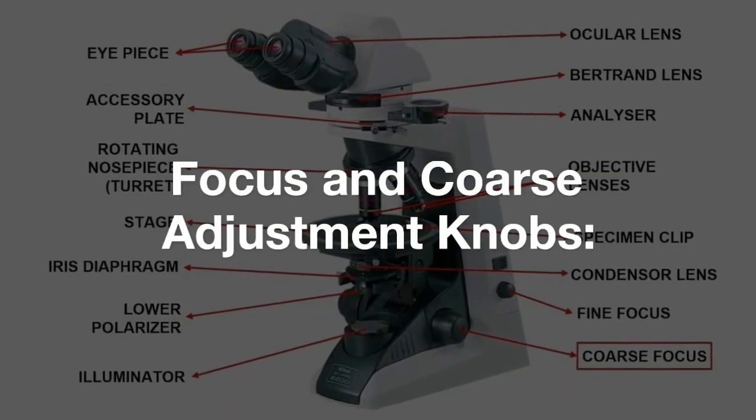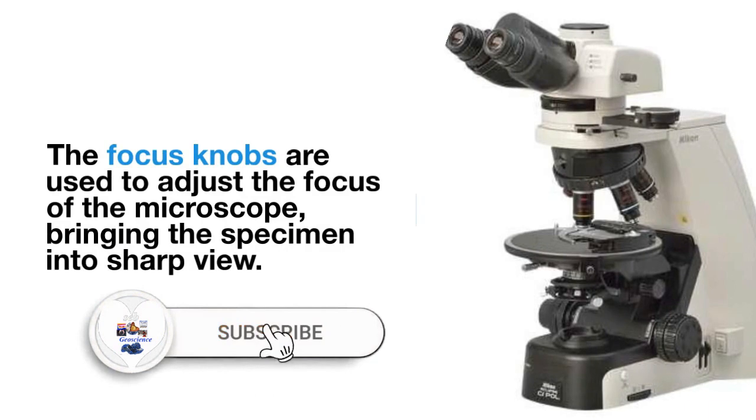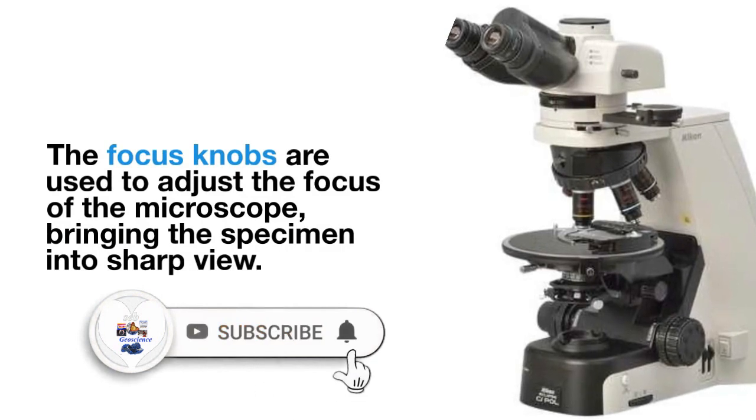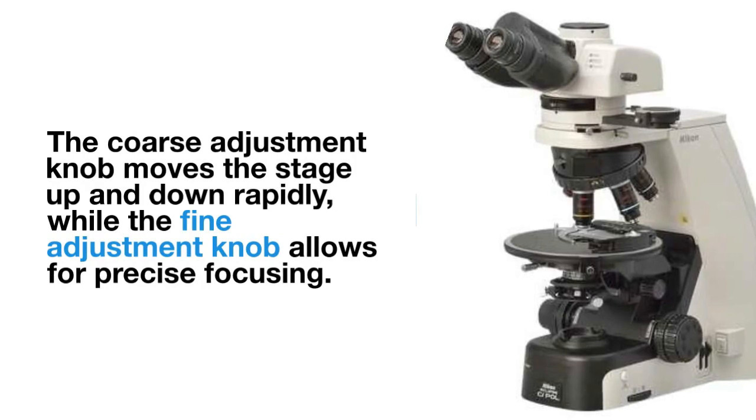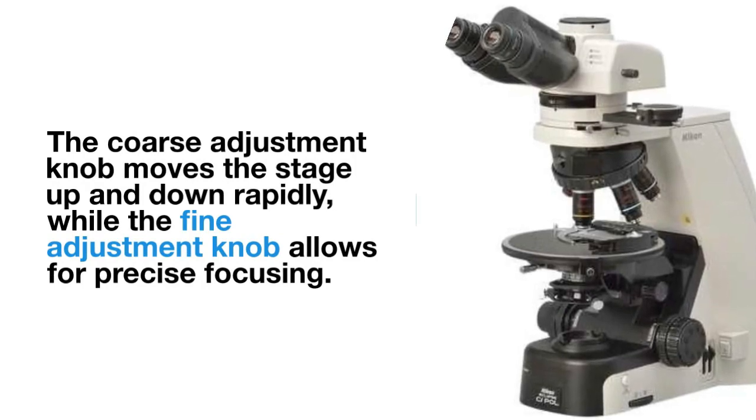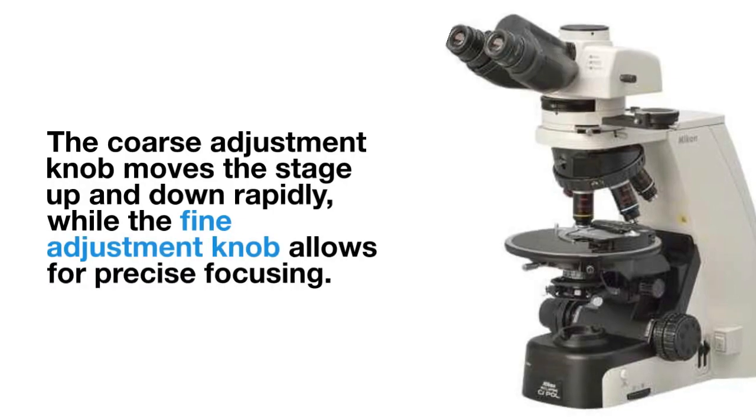Focus and course adjustment knobs. The focus knobs are used to adjust the focus of the microscope, bringing the specimen into sharp view. The course adjustment knob moves the stage up and down rapidly, while the fine adjustment knob allows for precise focusing.